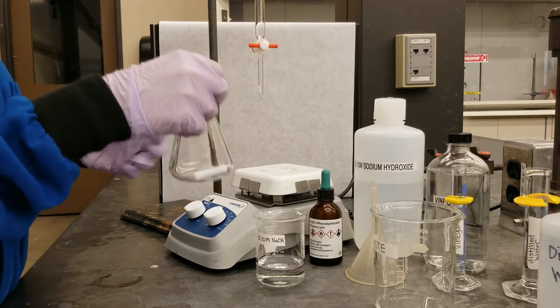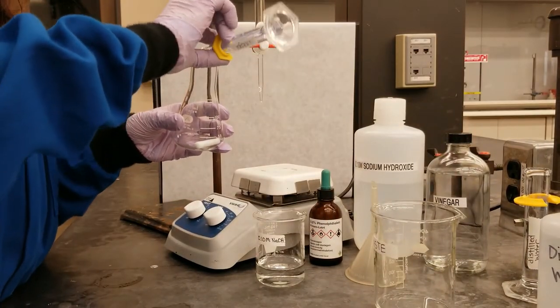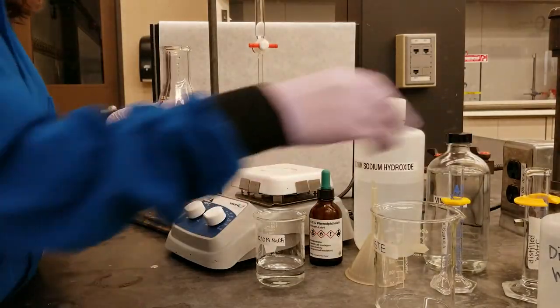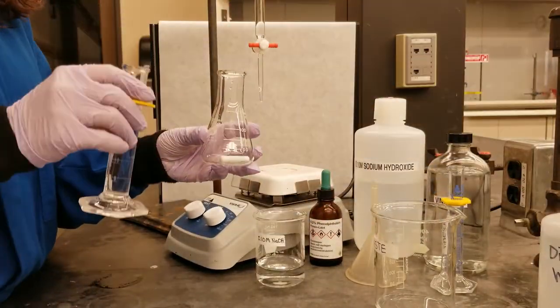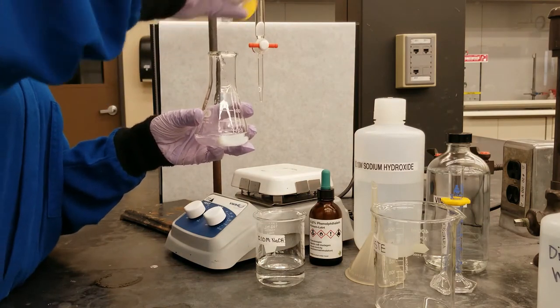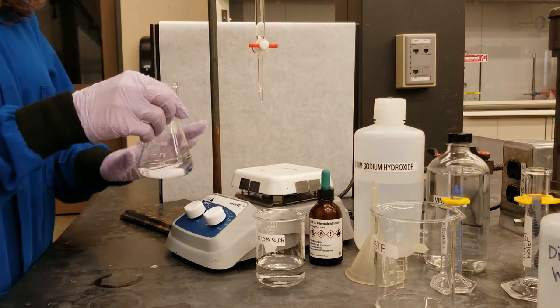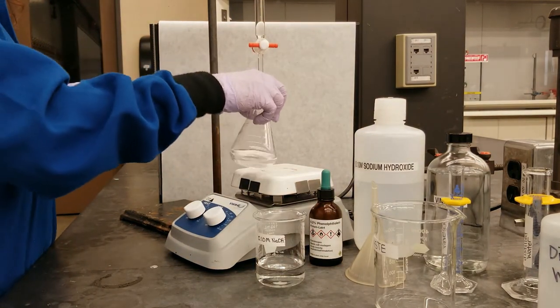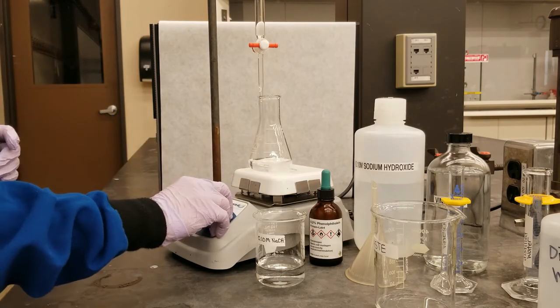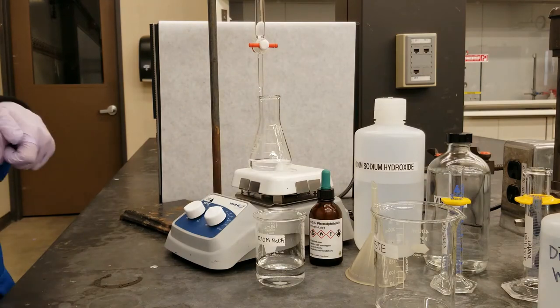From there, we'll take our Erlenmeyer flask and fill it with our 5 mils of vinegar. We will also add our distilled water into our Erlenmeyer flask. Now, because I don't have a lab partner, I'll be using a stir plate to make sure that the solution is being stirred throughout the entire experiment. So I'll let that stir initially to make sure that the solution is nice and even throughout.